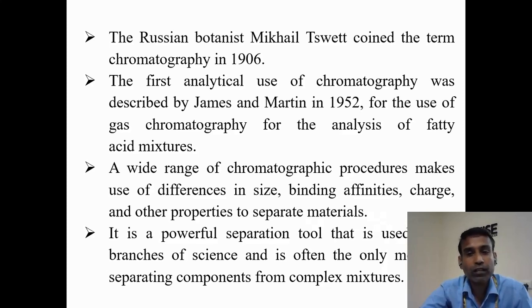So most of the food industry prefers the chromatographic techniques, and the results are highly accurate, though it is a time consuming process. But nowadays, because of advancements, the amount of sample required for analysis is very small, and the time consumption is also reducing year over year.